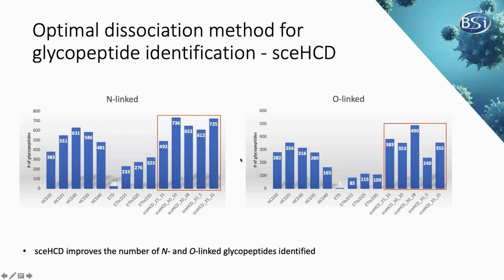So that all sounds good, but it's more important that we have accurate localization of glycans within our glycopeptide IDs rather than just reporting the total numbers identified. So next, I looked at peptides that scored above our A-score threshold, and those that we can confidently assign a glycosylation site to.